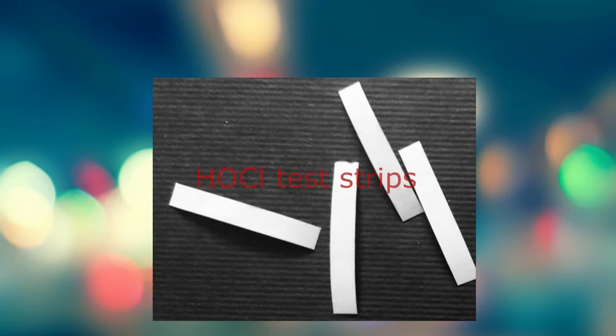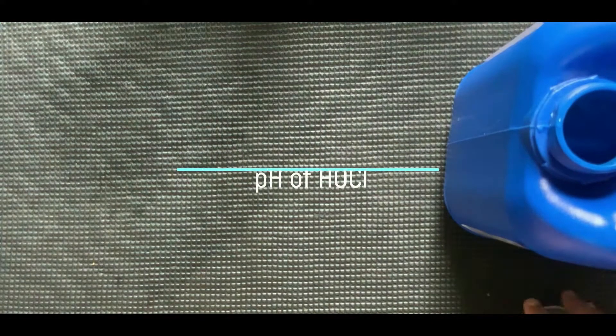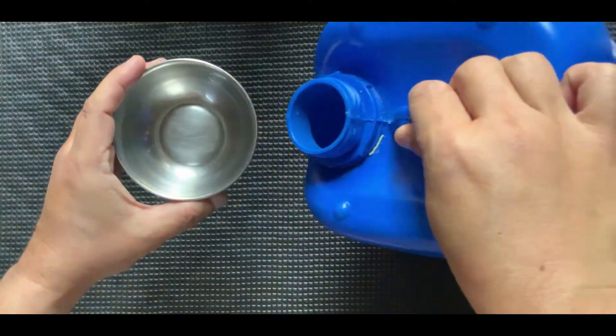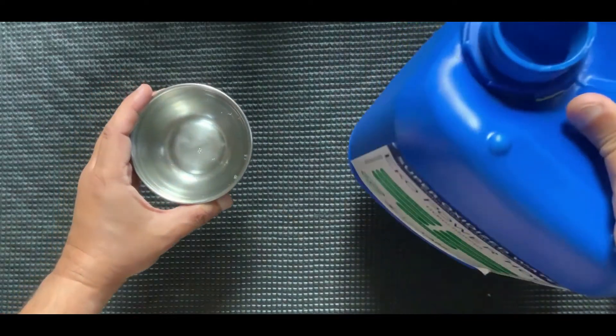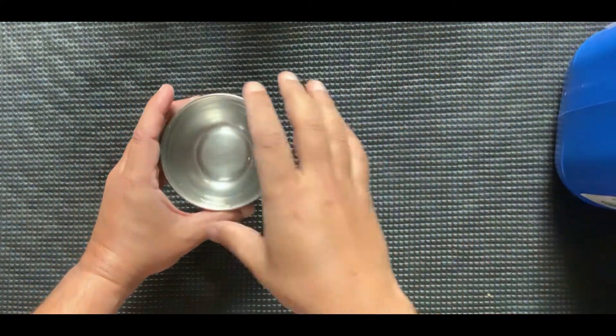pH Test Kit. HOCL Test Kit. Let's check the pH of HOCL. Take out HOCL from the 5 liter can into a small utensil like a bowl or a glass.